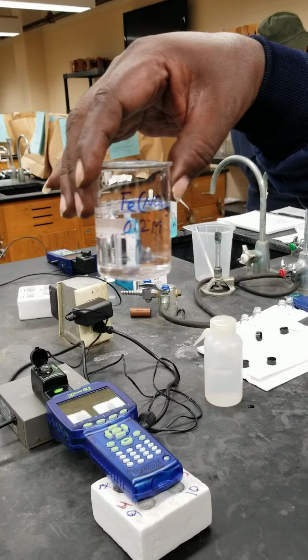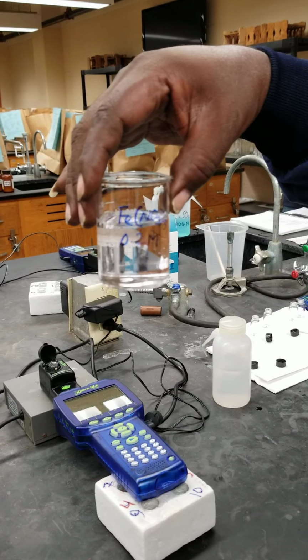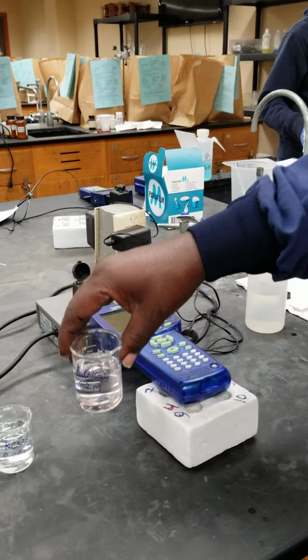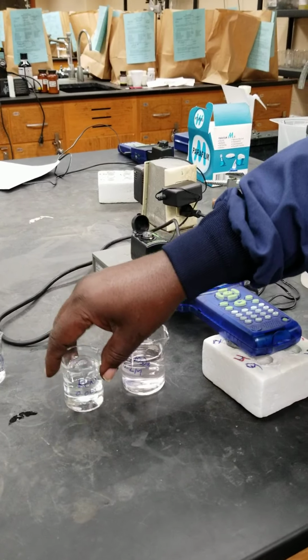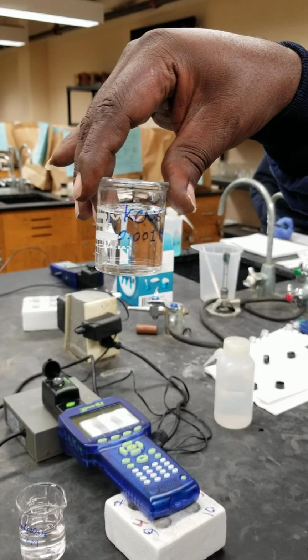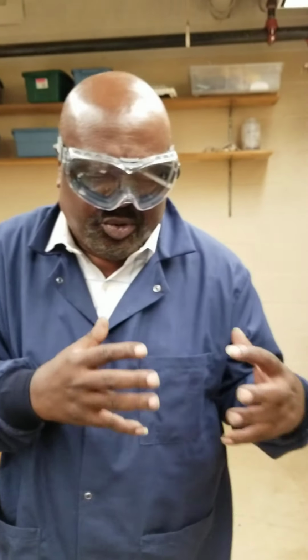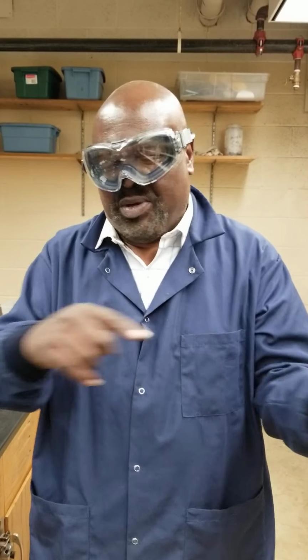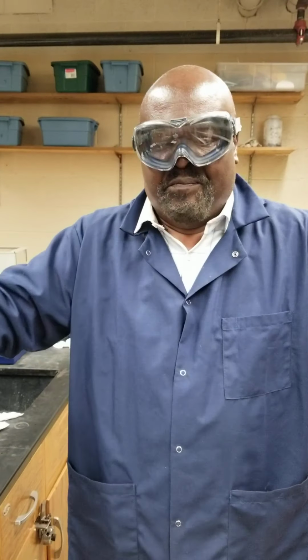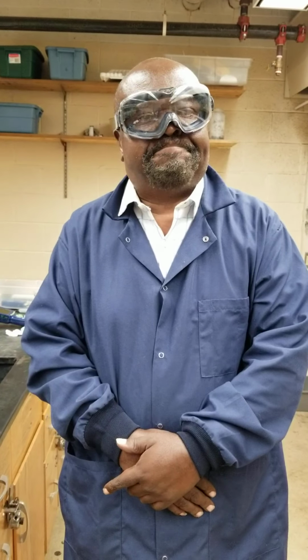So this is 0.2 molar of the Fe3+, and then we're going to add to that 0.001 molar of the KSCN. What does that mean? It means you have such a huge excess of one reagent that, for all practical purposes, we can assume a complete reaction into the formation of the product.